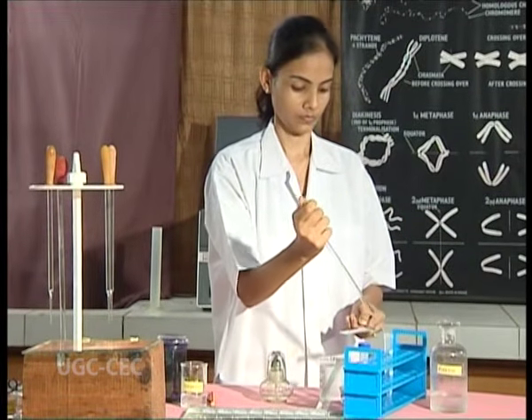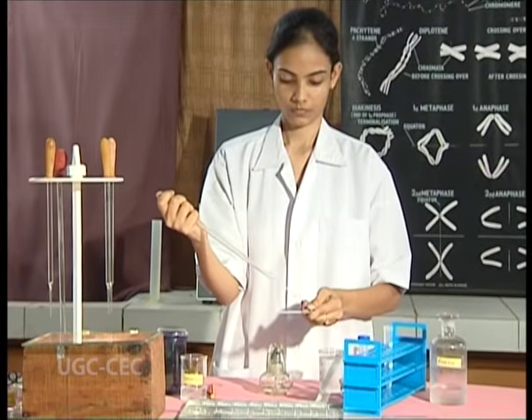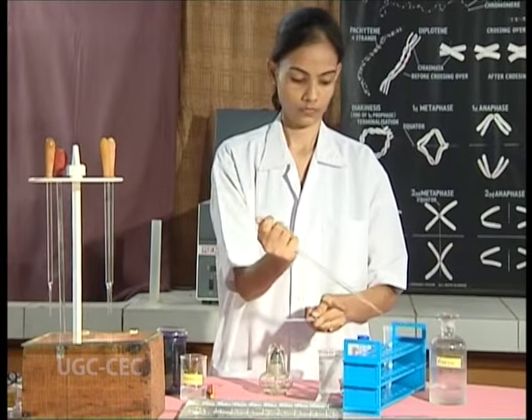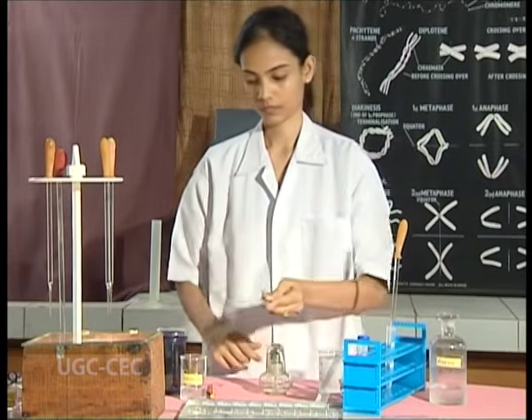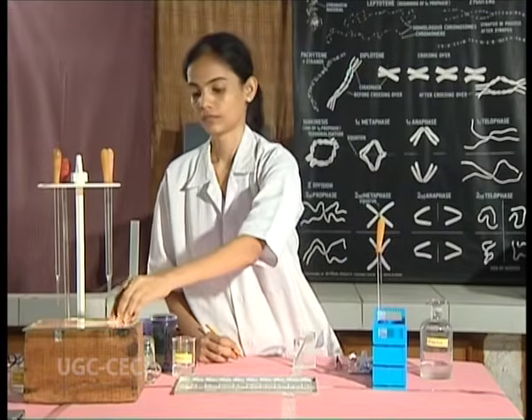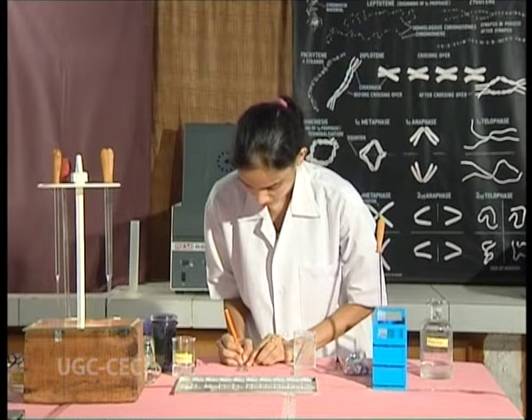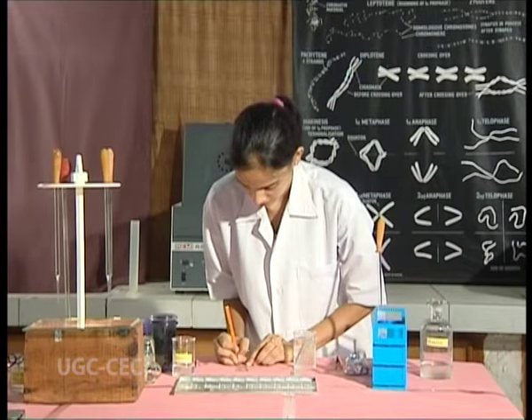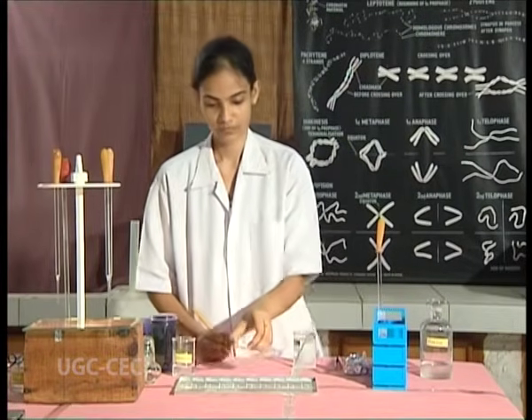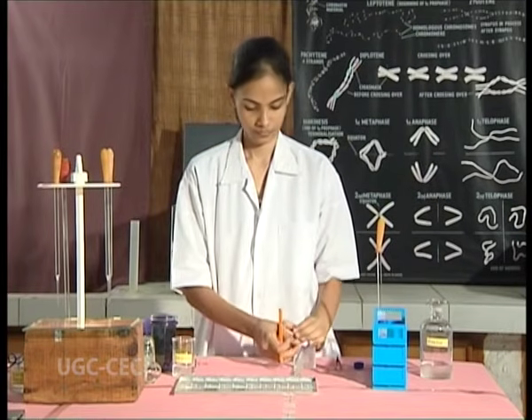The slides can also be prepared using a hot plate. 3 to 4 drops of cell suspension are placed onto the slide and kept on a hot plate for drying. Label the slides appropriately. Let the slides cool at room temperature.